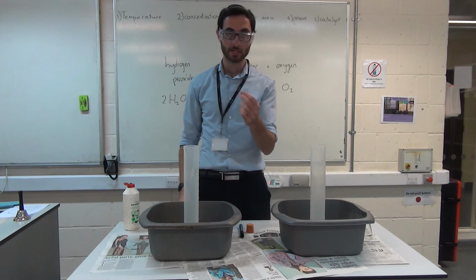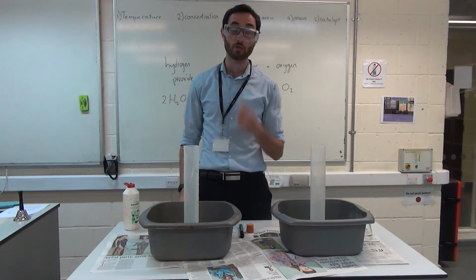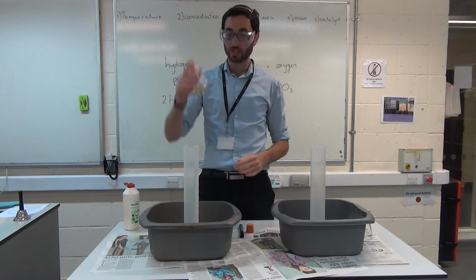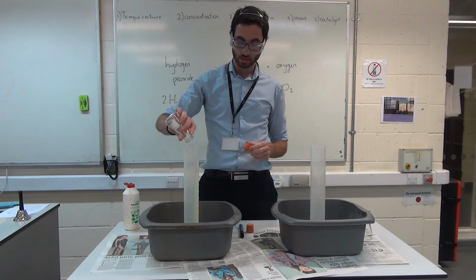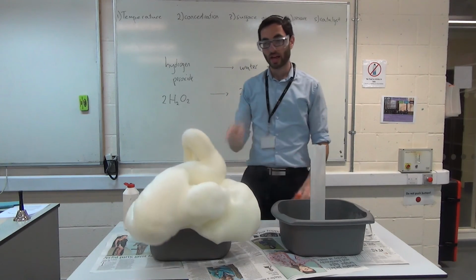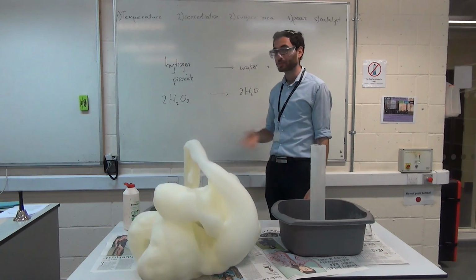Remember, what is a catalyst? A catalyst is a substance which speeds up a reaction, it increases the rate of reaction, but is not used up itself. For this reaction, I can use a catalyst called potassium iodide. And with any luck, when I pop that in there, now that going on there is this reaction. It's just quicker.